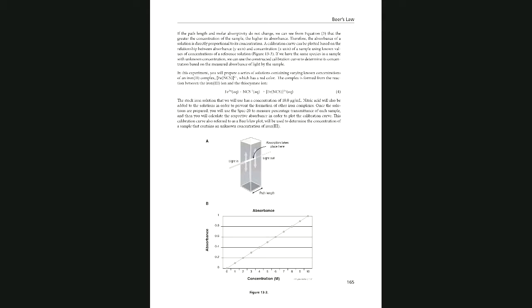Again, the purpose of performing this experiment is to be able to teach this class remotely. I'm not teaching the class, I'm just performing the experiment, but I have to explain what I'm doing. If it's me or another professor teaching the class, they will explain more about the theory and set up expectations.